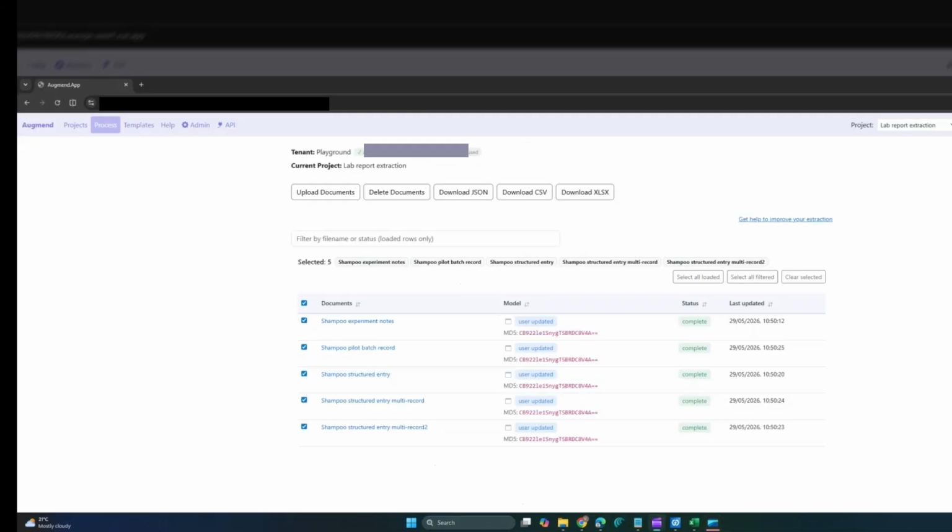favorable. Now, to process these 5 documents, what we need to do is upload them into the app using this upload button. So I'm already in the app. I've used the upload button to upload these. They then get automatically extracted, and the results can be downloaded into Excel. Given that in this demo, we are going to focus much more on the results, we are not going to look at how the app works, and we are straight away going into the Excel where the results are located.